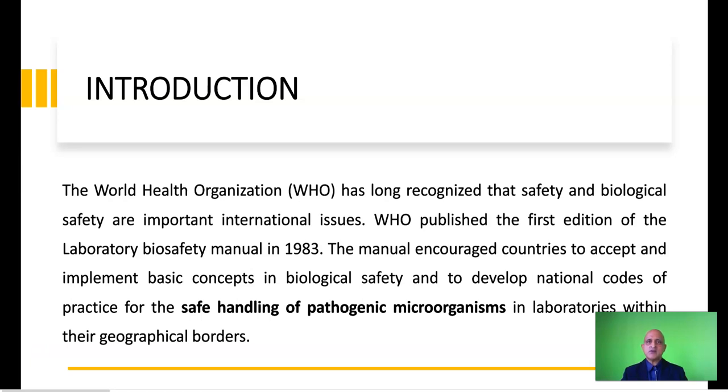At the basis of this particular manual is a recognition that safety and biological safety are very important international issues. Keeping this in mind, the WHO published the first biosafety manual in 1983. What the manual encourages member states as well as individual laboratories to do is to implement the basic concepts of biological safety for the safe handling of pathogenic microorganisms within your geographical borders.